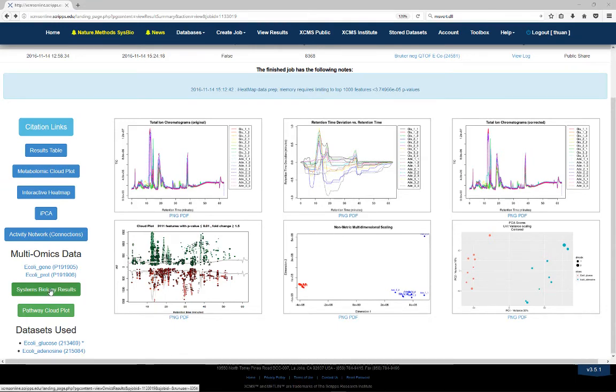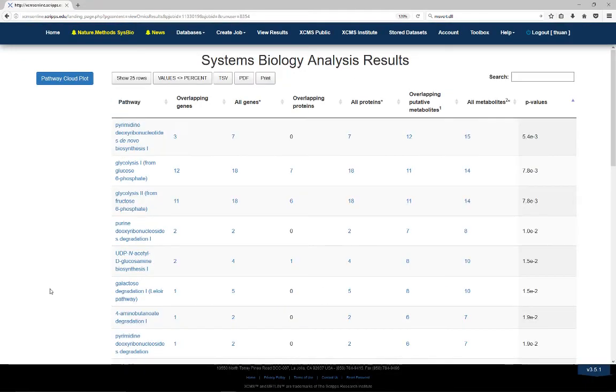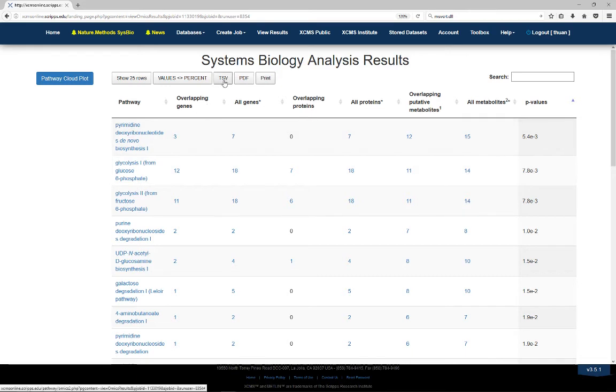To view differentially expressed genes and proteins that are overlapping with the predicted dysregulated pathways, click the Systems Biology Results button. Genes and proteins matching with the dysregulated pathways will now be tabulated in the results table. The overlap list can be downloaded in TSV or PDF format at the top of the table.